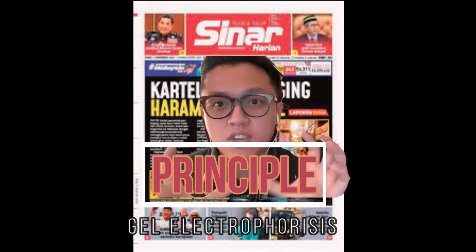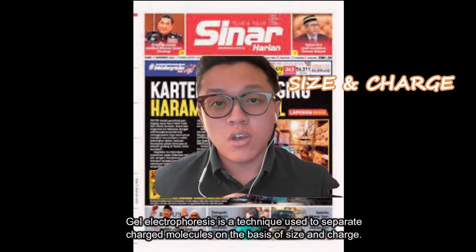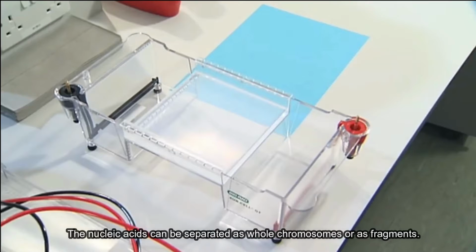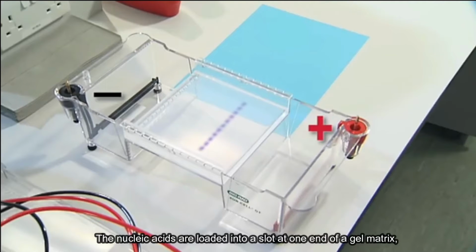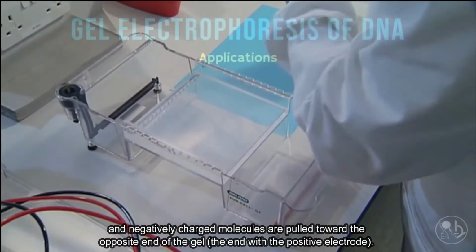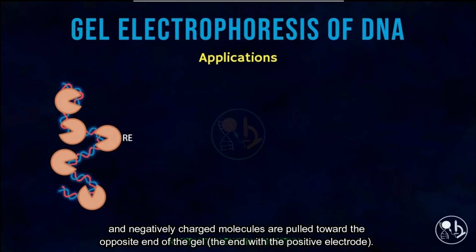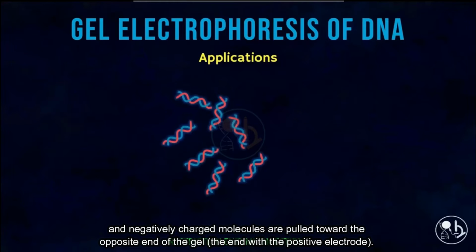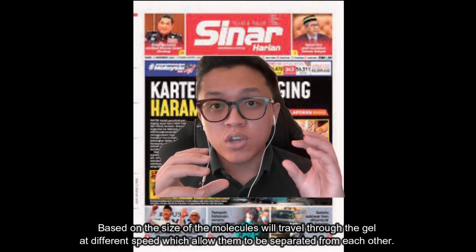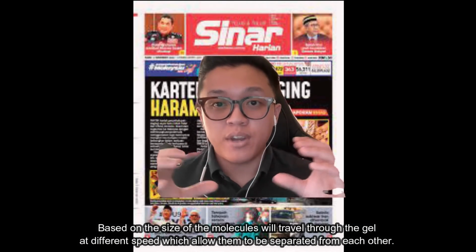It is a technique used to separate charged molecules on the basis of size and charge. Nucleic acid can be separated as whole chromosomes or as fragments. The nucleic acids are loaded into a slot at one end of a gel matrix, and an electric current is applied, and negatively charged molecules are pulled toward the opposite end of the gel, which is the end with the positive electrode. Based on the size of the molecules, they will travel through the gel at different speeds, which allows them to separate from each other.